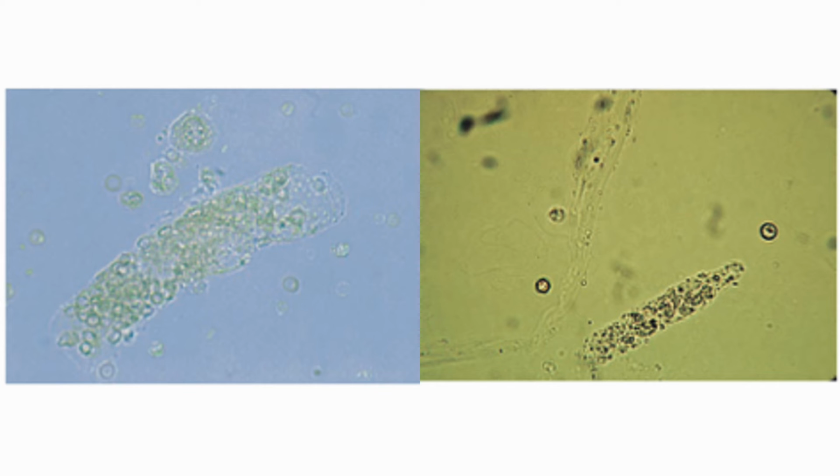So we see a red blood cell cast here. Notice the presence of hypochromic and dysmorphic free red cells in the periphery. Now we see here a red blood cell cast and a disintegrating one, and notice the presence of the free red cells to confirm the identification of the RBC cast. As an RBC cast ages, cell lysis begins and the cast develops a more homogeneous appearance, but typically retains the characteristic orange-red color from the released hemoglobin.